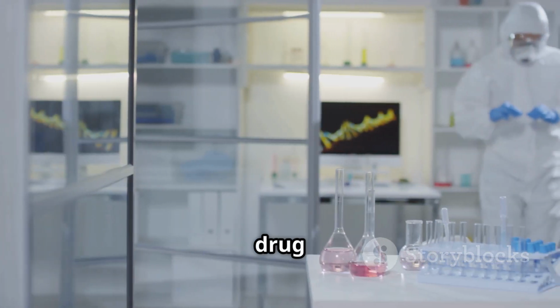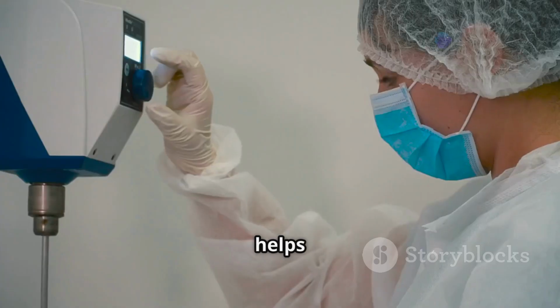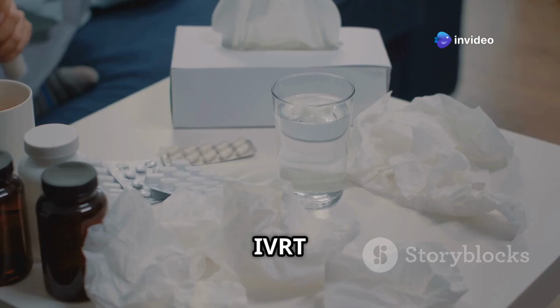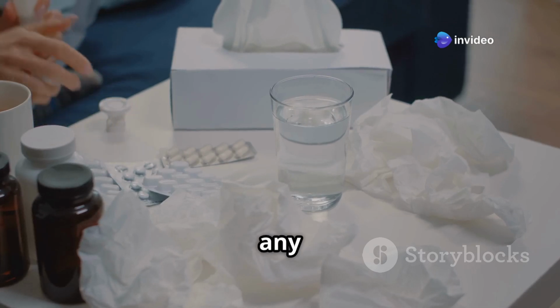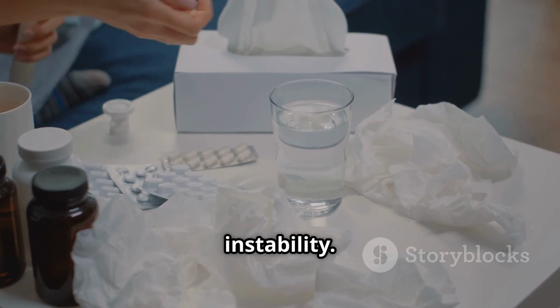By analyzing how a drug is released, we can predict how well it will be absorbed by the body. This helps us determine the optimal dose and dosage form for a particular drug. IVRT also helps us identify any potential problems with the drug's formulation, such as poor dissolution or instability.